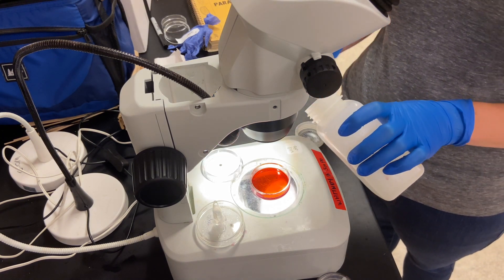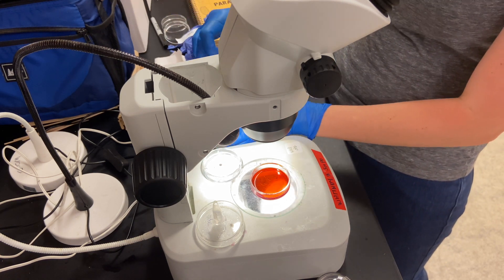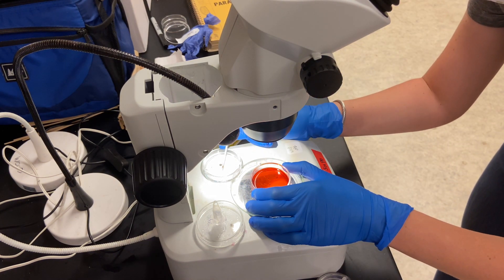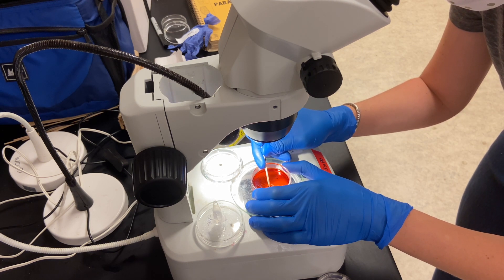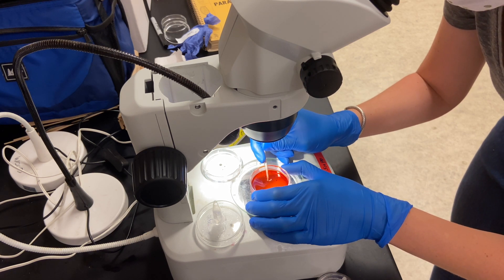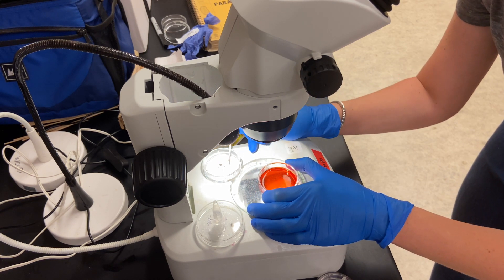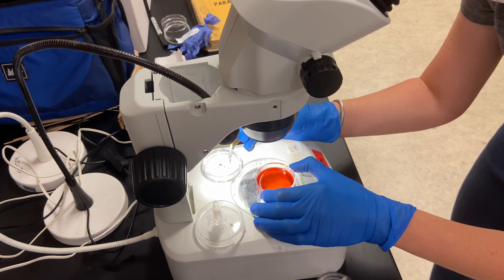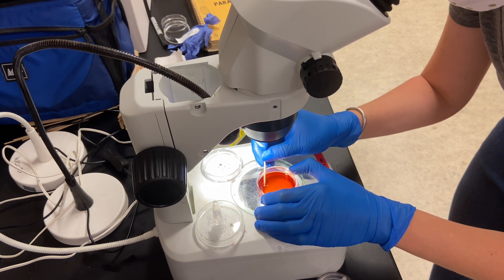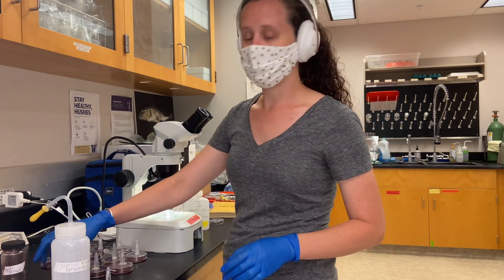So I'm going to add my acid alcohol to an empty petri dish bottom, just enough to cover the specimens. Then I'm going to use a wooden applicator stick so I don't damage the specimens and move them over. After moving them over I run through the petri dish with the stain in it just to make sure I didn't leave any pieces of parasites behind. Then I cover this and I'll reuse the stain, so I'll empty the stain back into the container.